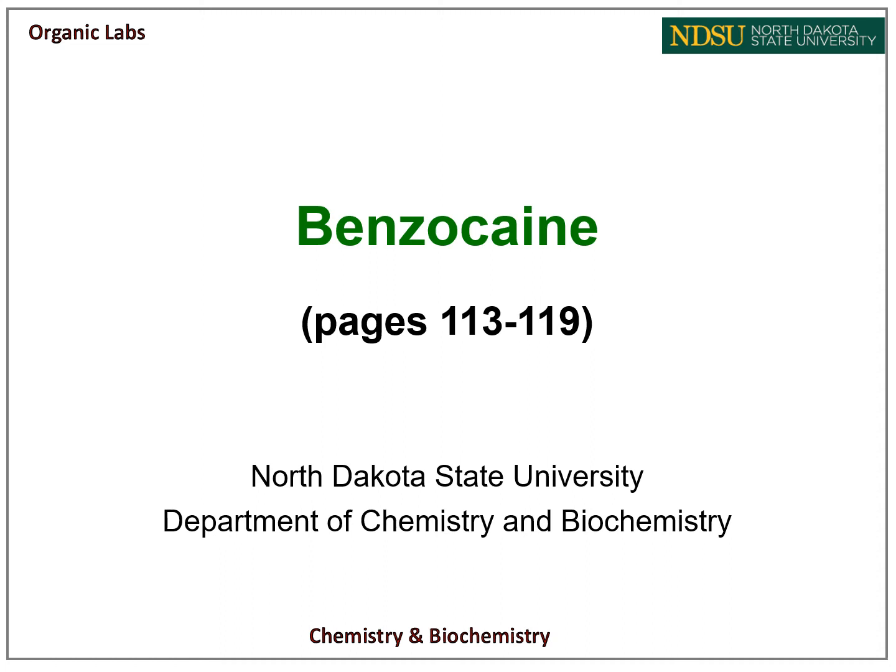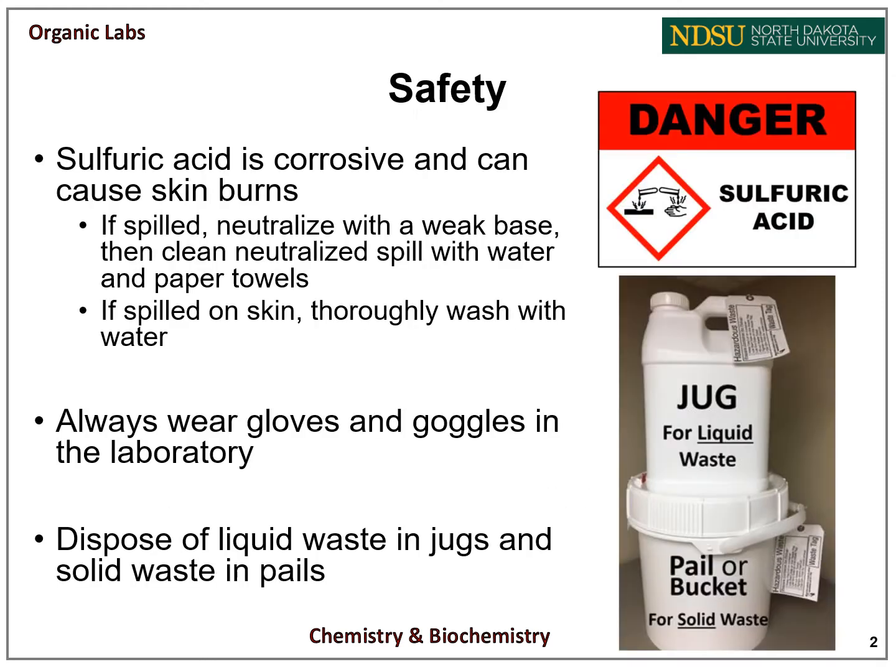Hello everybody. In this video I will be talking about the benzocaine lab which we will be doing this week. First, for some safety considerations. This week we will be working with sulfuric acid, which is corrosive and can cause skin burns.